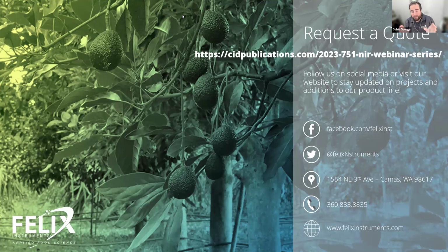And so because there are discrepancies between those methods, you can't expect the model to perform the exact same as your microwave results, because that's not what the model was built on. The model was built on results from dehydration using forced air. And so there are a lot of things to consider there. The basis of what I'm trying to say is you need to perform testing on your end to be fully assured that the predictions are accurate, but you need to perform those tests using analytical methods that align with the analytical methods used to create the models.